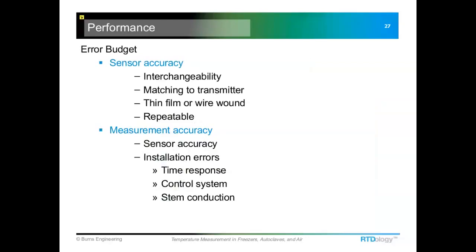There was a question back when you were talking about autoclave sensors, and the question is, do you use the same methodology for HAST or HAST chambers, which are highly accelerated stress tests? It would be similar, except that there's some special considerations.